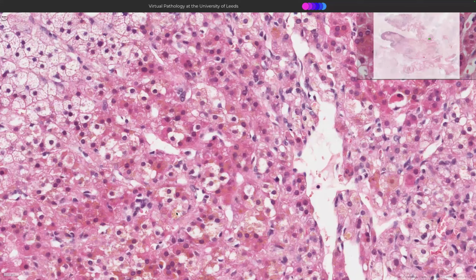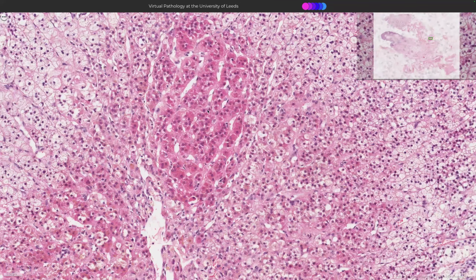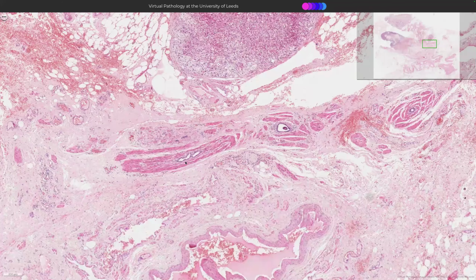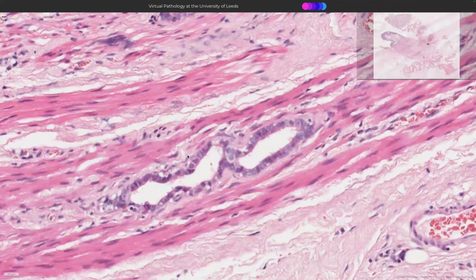So my story is some people have hepatitis, and before they have hepatitis, they have a liver full of this lipofuscin. But after they've had hepatitis, where most of the liver cells have died and they regenerate, it all goes away because they have new cells. So it tells you that these cells have been sitting around here being a bit inactive for a long time, as expected. Right, down here we've got some other little things. What are these things in the adjacency of the ovary?